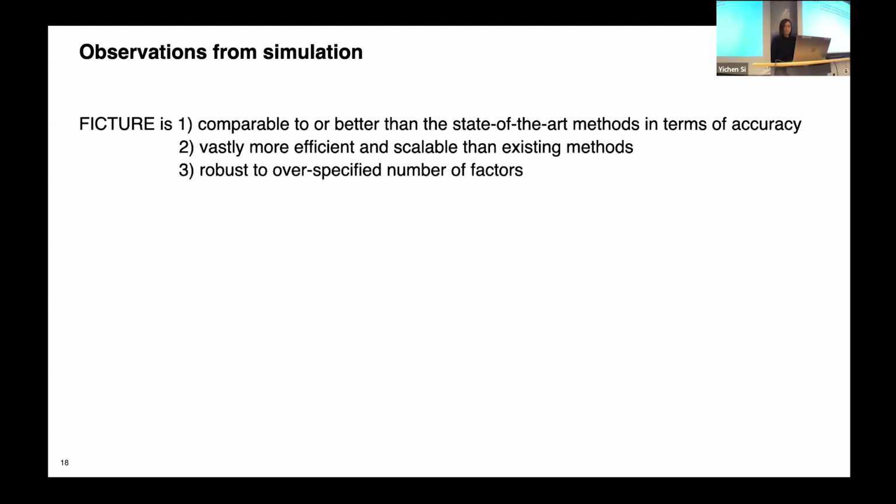So based on our current implementation, I can only think that you can use your segmentation to initialize FICTURE, but it's possible to extend our method to incorporate some of the cell segmentation information and try to improve that, because in the end, what we got is a pixel level cell assignment that may not be consistent with the initial segment.